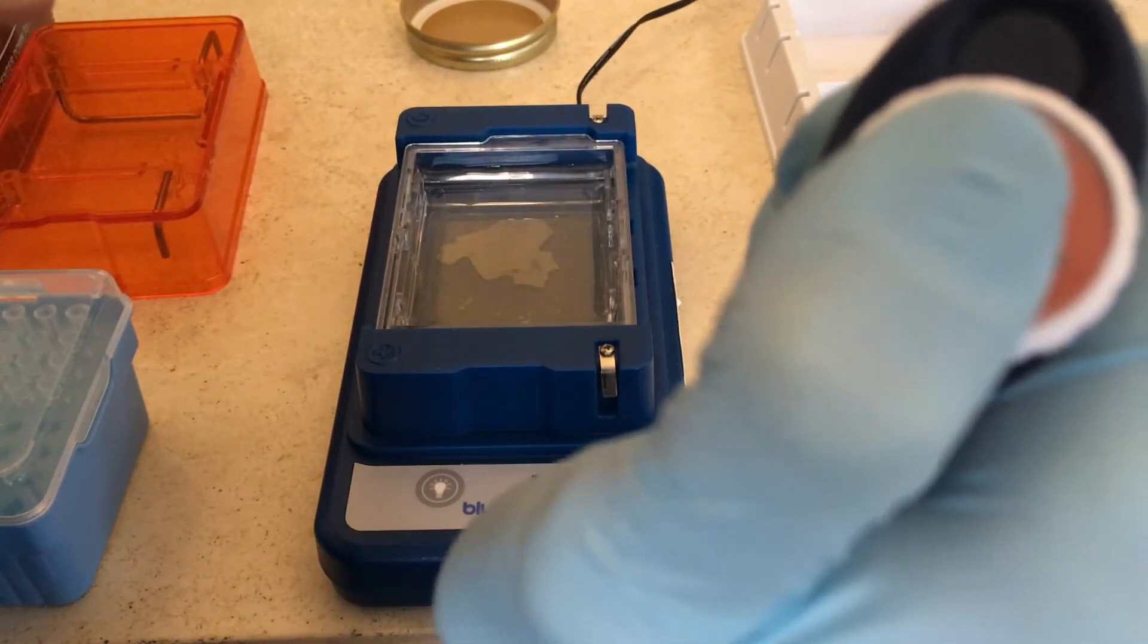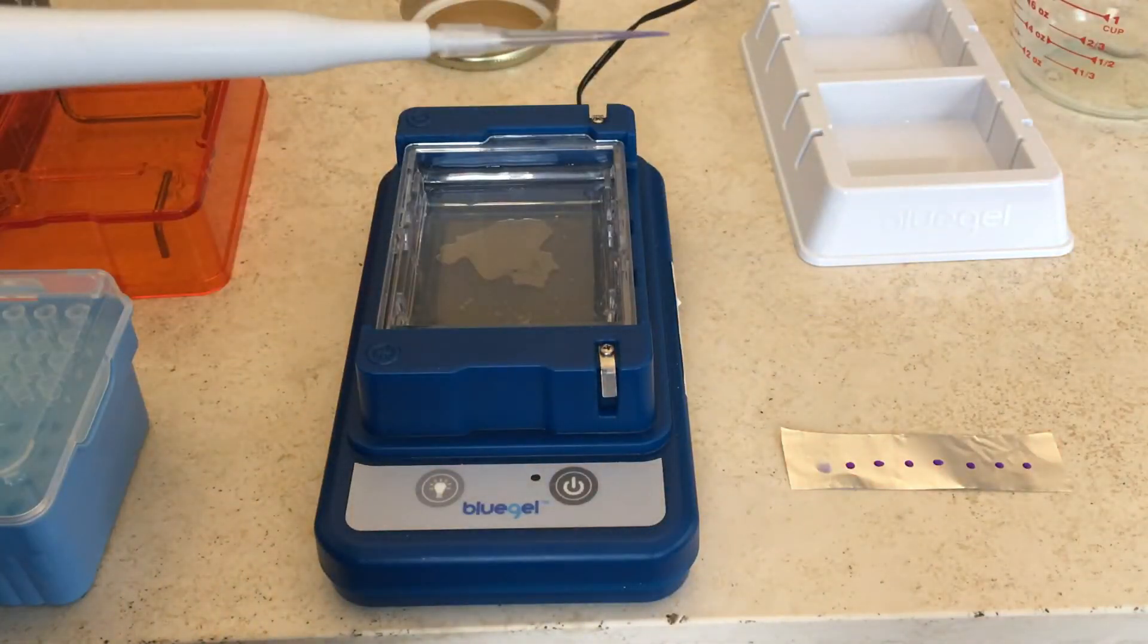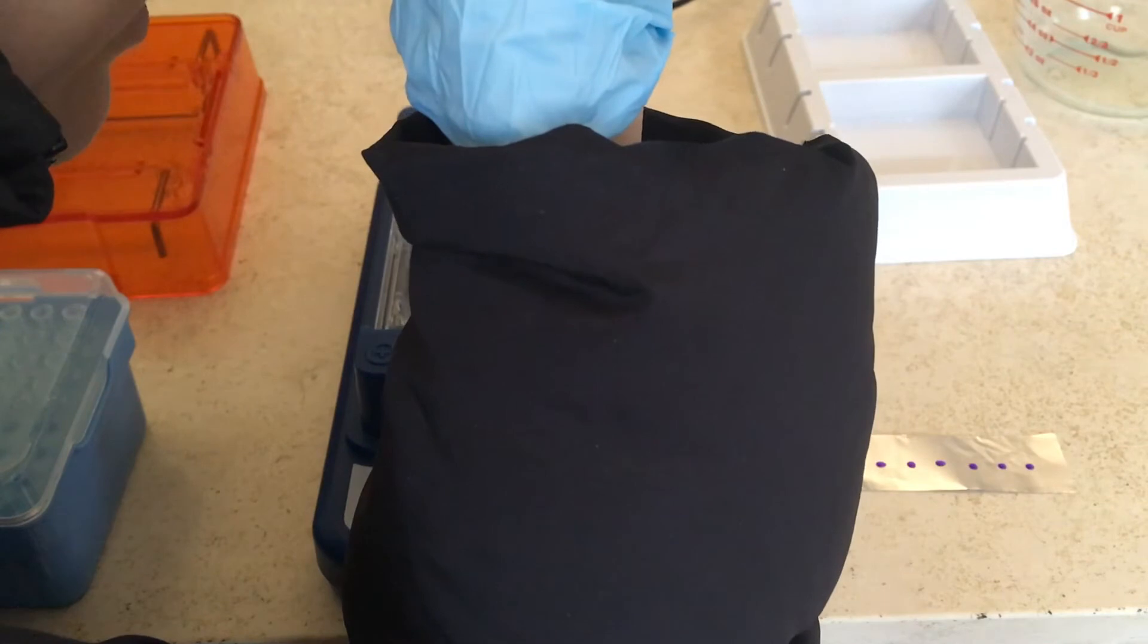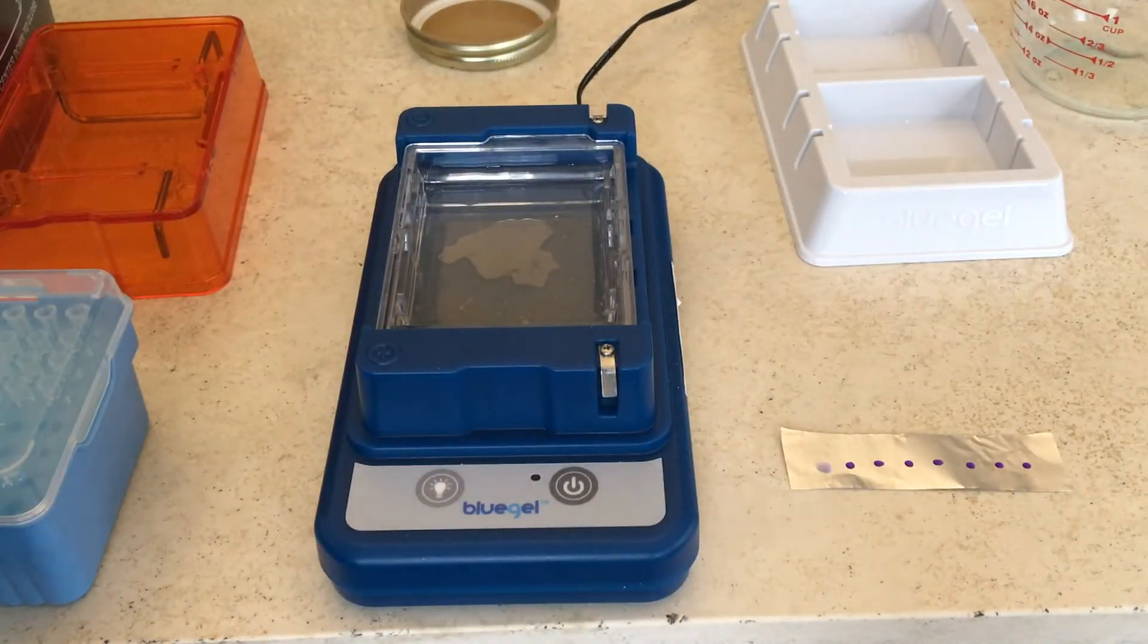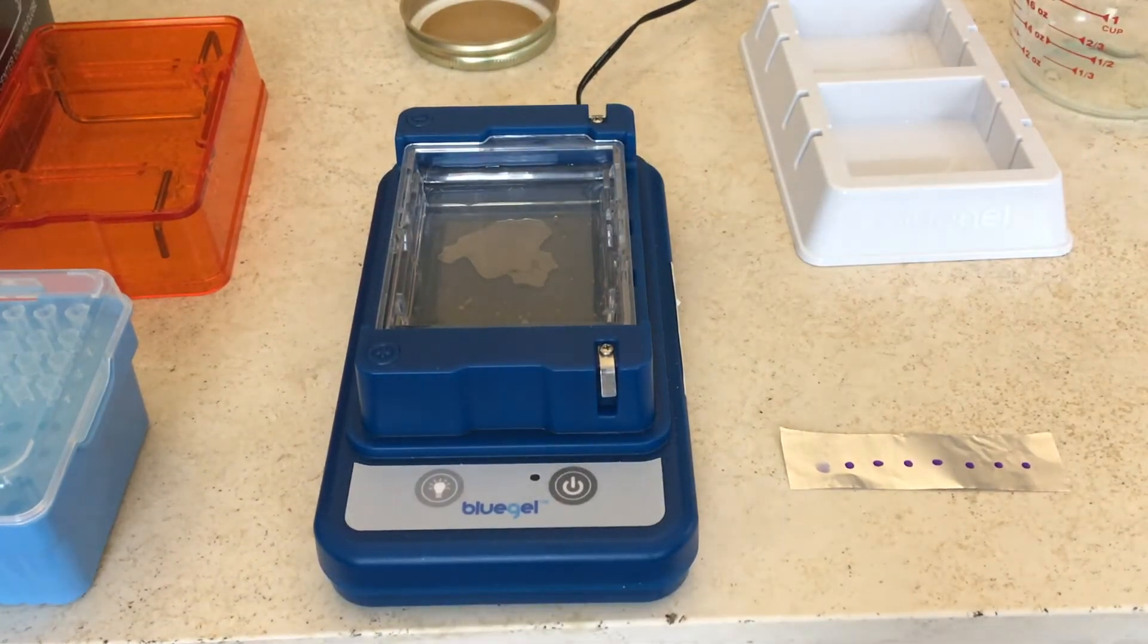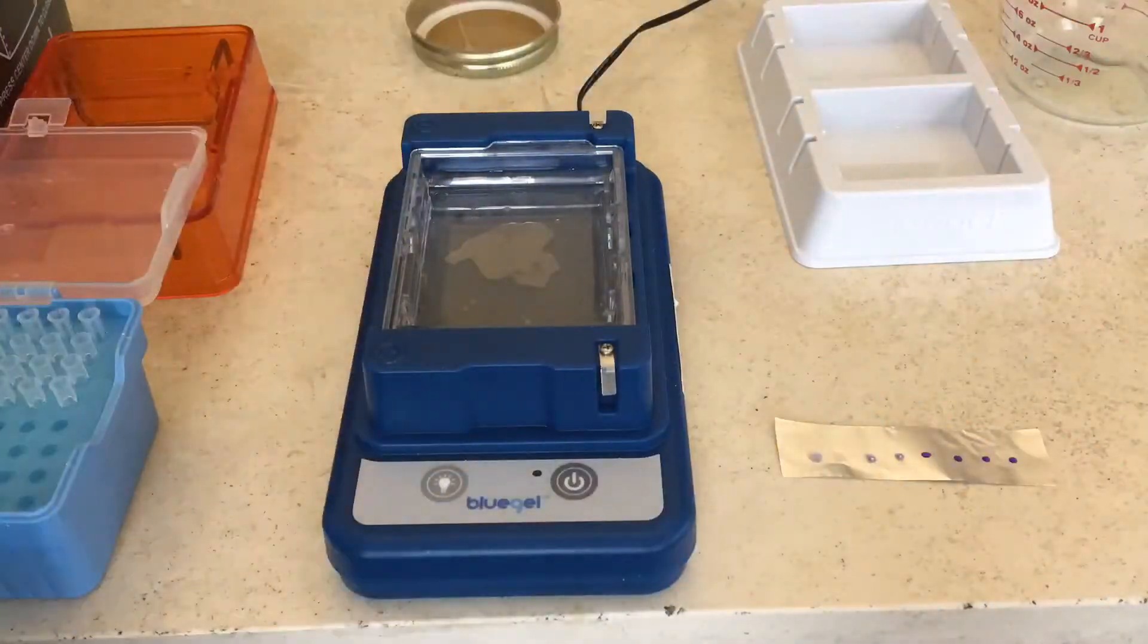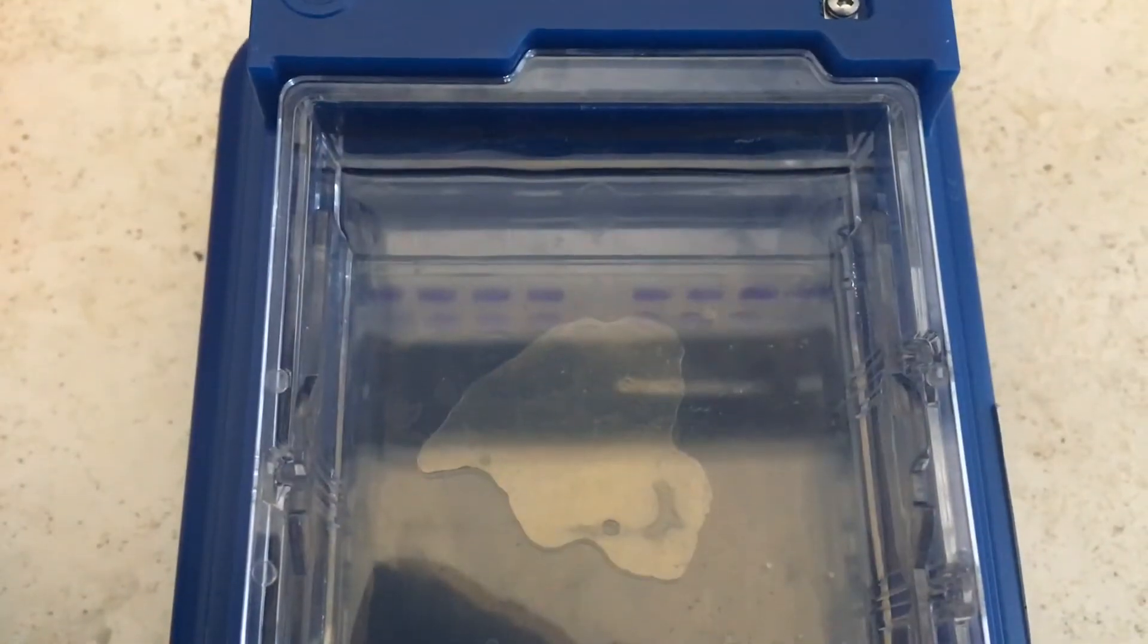Then we're going to aspirate it all back in so it's in the pipette, the mix of the loading dye and the actual DNA template, and then we're going to inject it into one of the wells that's been created by the comb. And you're going to have to use a different pipette tip obviously for each of the samples.